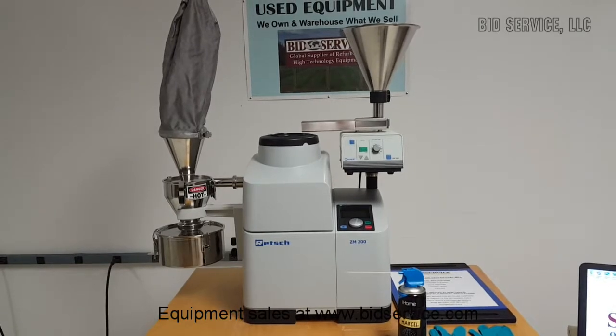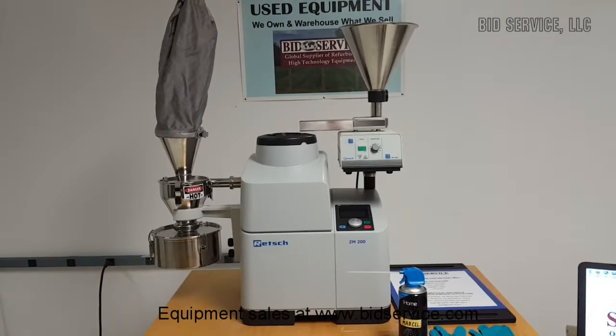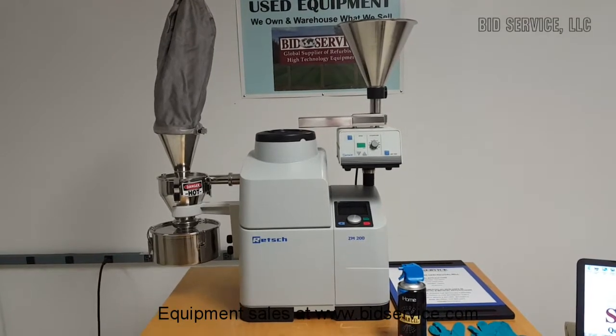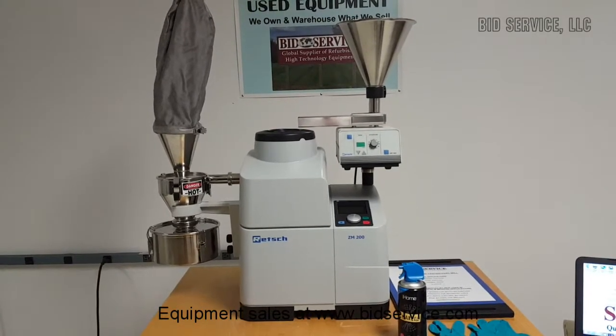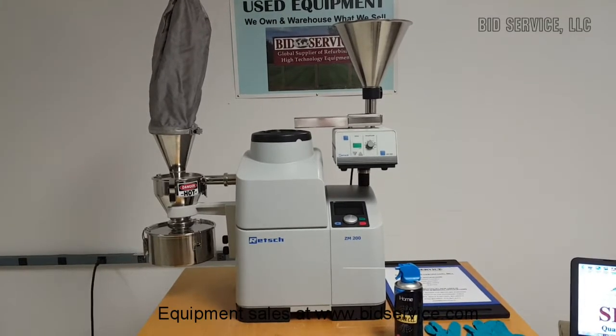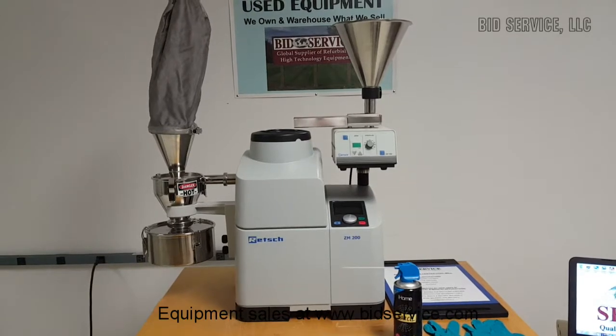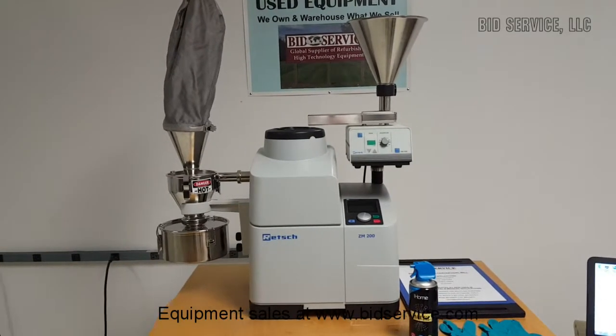This is a demonstration of the Retsch Ultra Centrifugal Mill. The Ultra Centrifugal Mill ZM200 is a high-speed rotor mill with unmatched performance. It is used for the rapid size reduction of soft to medium-hard and fibrous materials.